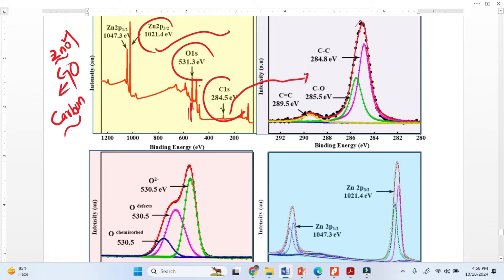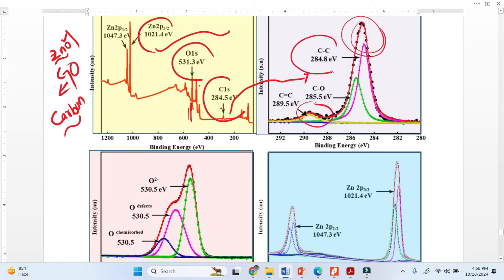In the carbon peak deconvolution you can see one big peak and another peak here. We can identify three types of bonding: carbon–carbon, carbon–oxygen, and carbon with a double bond.